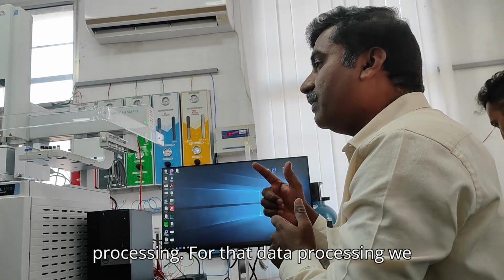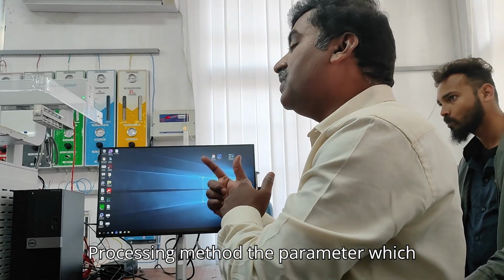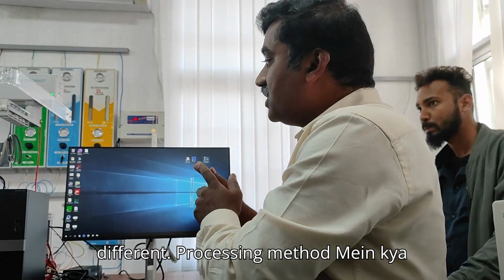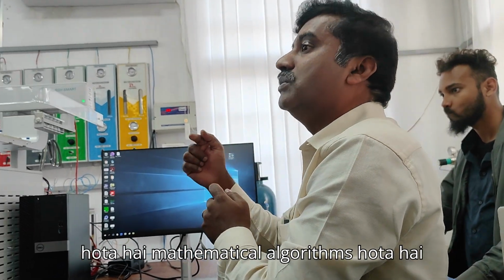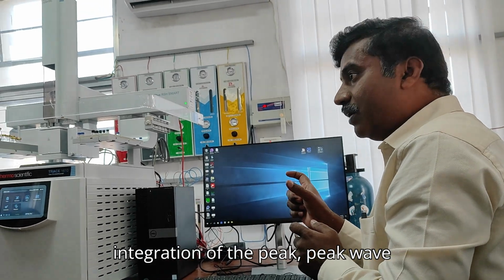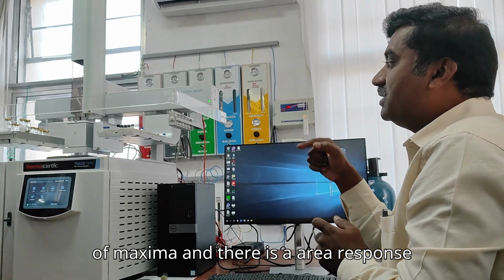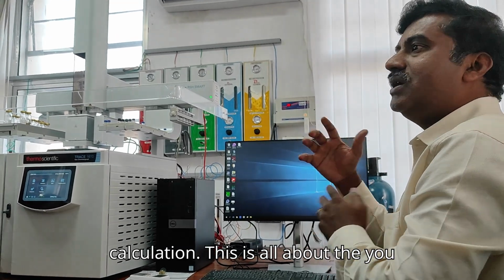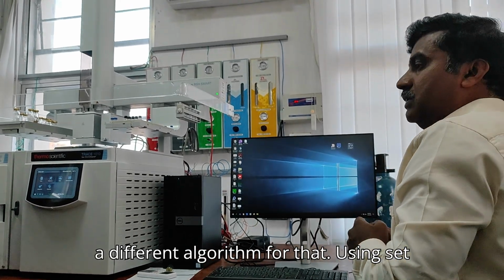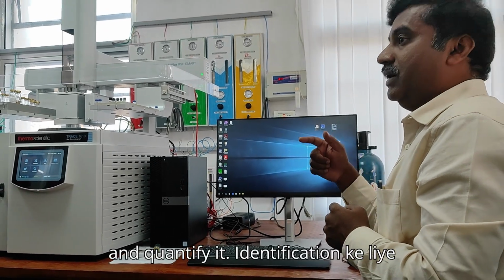For that data processing, we have to create one more processing method. The parameters involved in the instrument method are different and the processing method's are different. What is in the processing method? Mathematical algorithms. Mathematical algorithms mean the integration of the peak width, retention time calculation, full width at half maxima, and area response calculation. This is all about mathematical expression, right? So we have different algorithms for that. Using a set of algorithms, we can integrate the peak and quantify it.